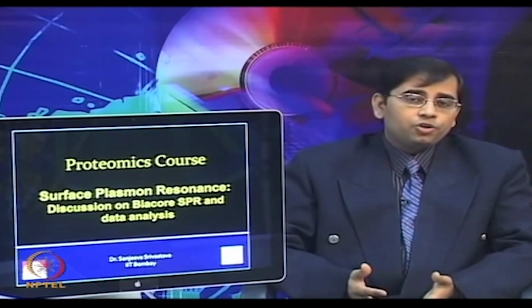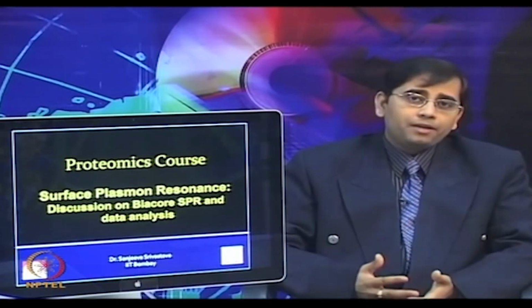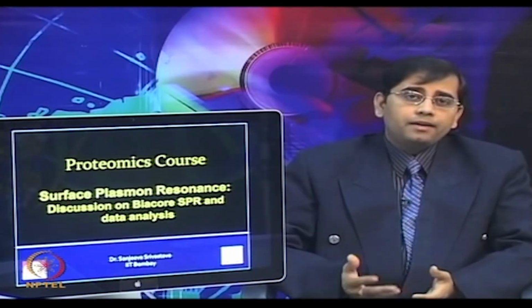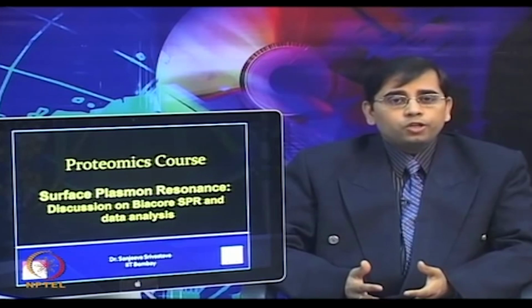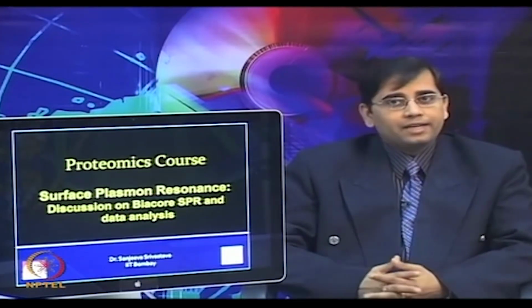The identification of interacting protein partners of known function with those having an uncharacterized role, by performing these types of experiments, makes it possible to understand the biological process of uncharacterized proteins.